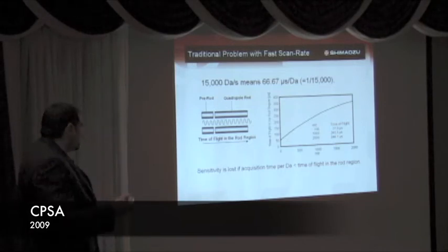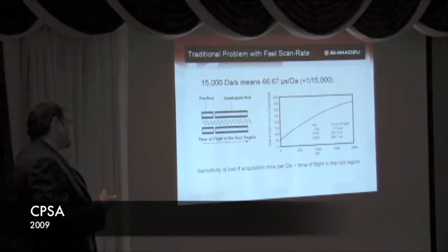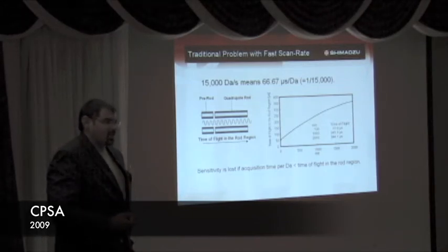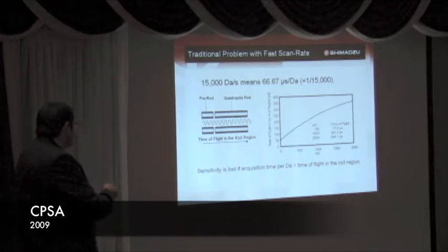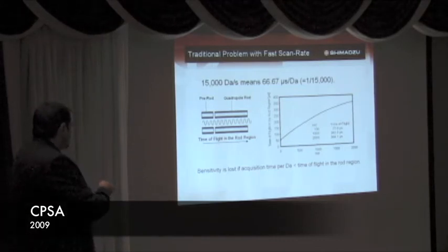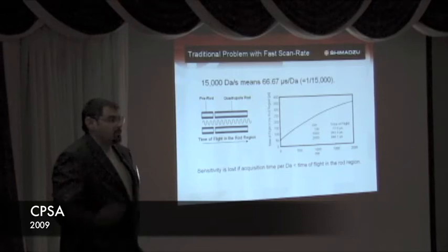And we think about that when I'm scanning at 15,000 AMU per second. If I translate that, it means I'm scanning or dwelling for about 66 microseconds on every mass that I'm analyzing. And if you briefly consider that a quadrupole is actually a time of flight region, the amount of time we're dwelling is less than the amount of time it takes something that's even 100 m/z to cross that quad. That's why we lose sensitivity.